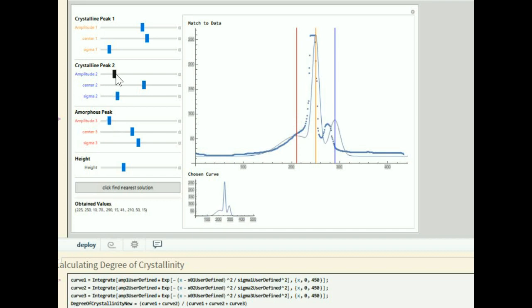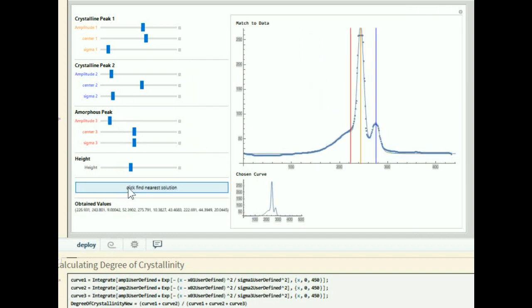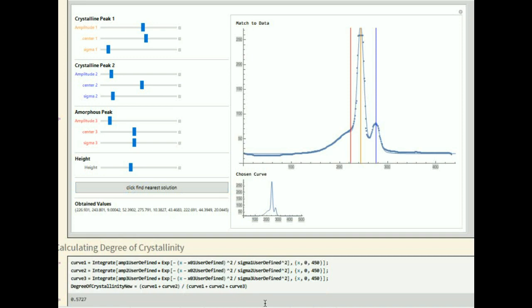Once you think you have a fit that's fairly reasonable, you can click find near solution. And Mathematica is going to help you find the best fit for this data. Then using these Mathematica found values, you can calculate degree of crystallinity for the curve.